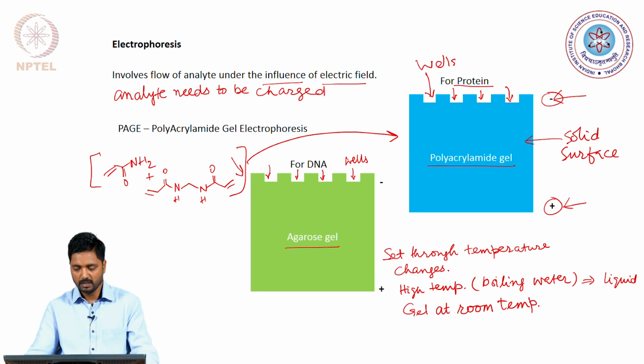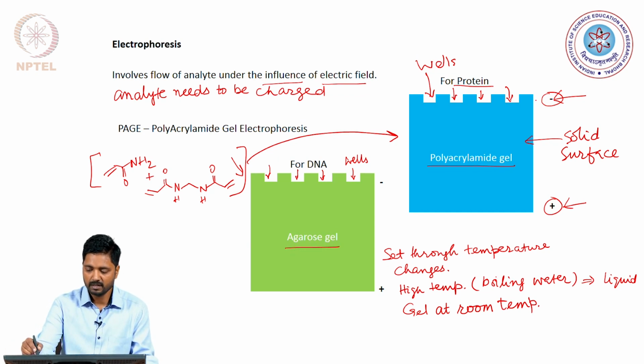Now, when the protein or the DNA fragment moves through this gel, it experiences two very different forces here. One obviously is a force that moves the protein from the negative electrode to the positive electrode.